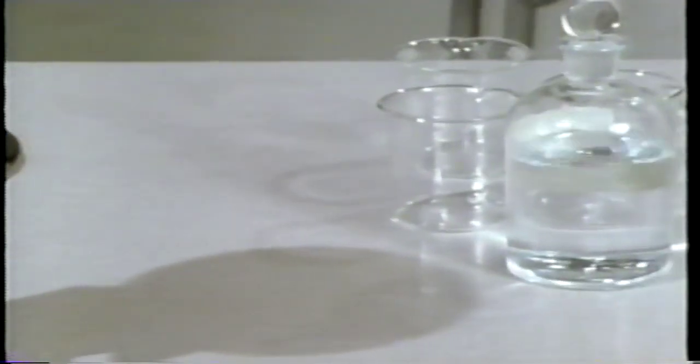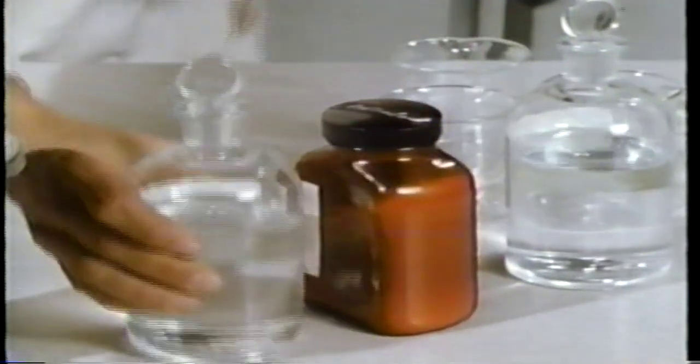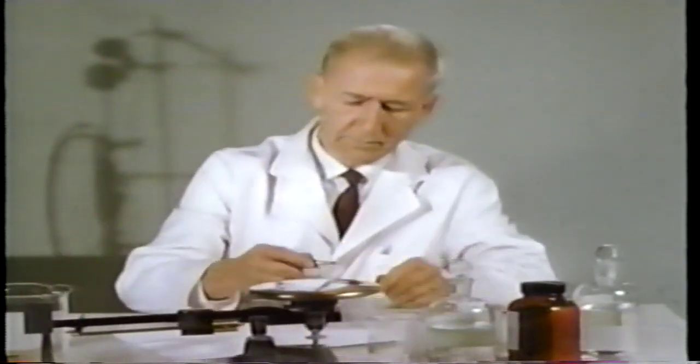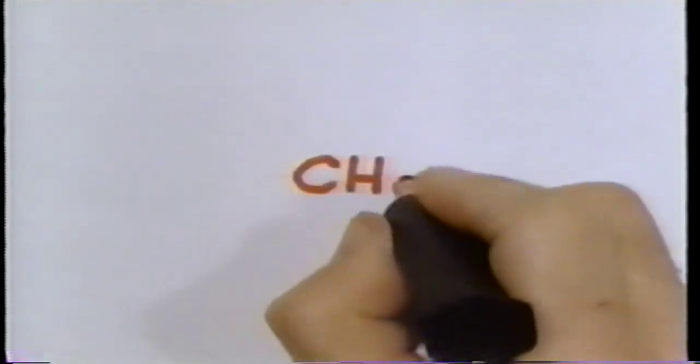As a first step, Dr. Geisman assembles the apparatus and the reagents. But how much of each reagent will be needed? To find out, we first write a balanced equation for the reaction. This is the way we do it. We start with the structural formula for 2-butanol.